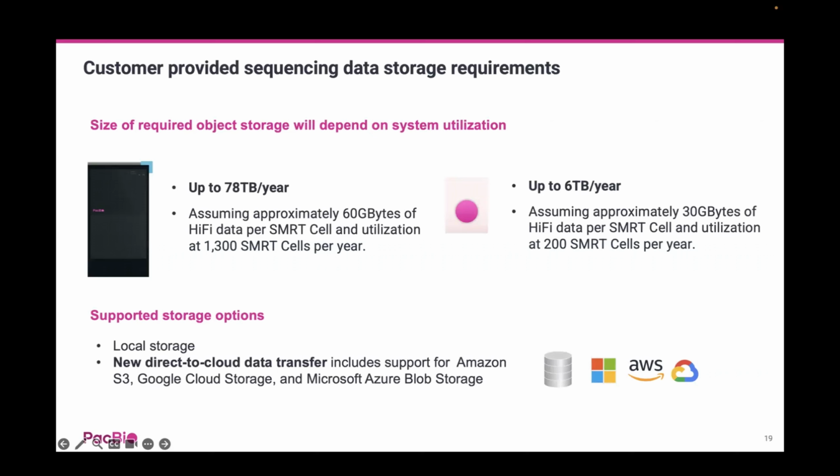It's recommended that you purchase more storage than you think you need in order to allow for increased utilization in the future. If you decide to go with a cloud storage provider, SmartLink Cloud supports Amazon S3, Google Cloud Storage, and Microsoft Azure Blob Storage.